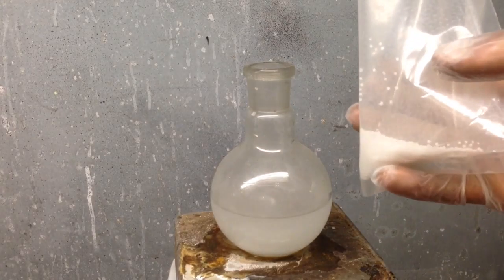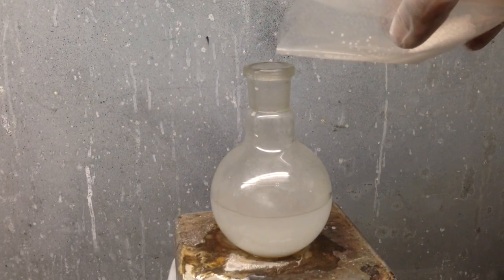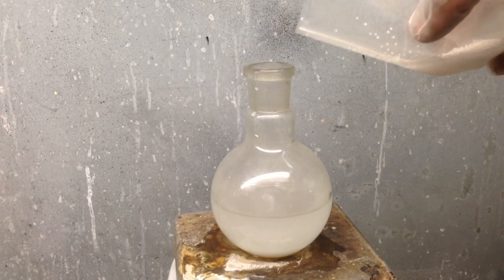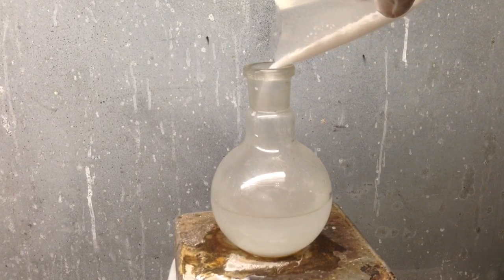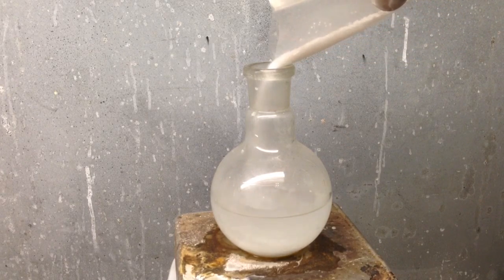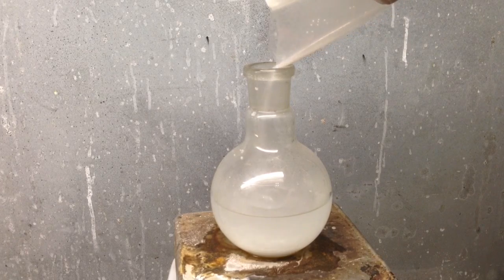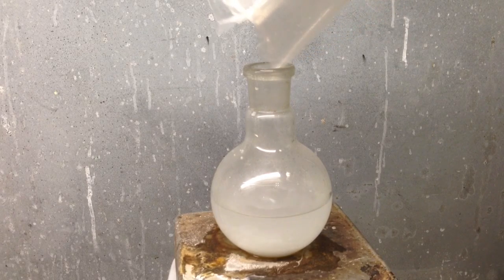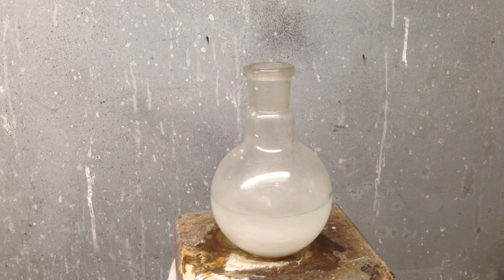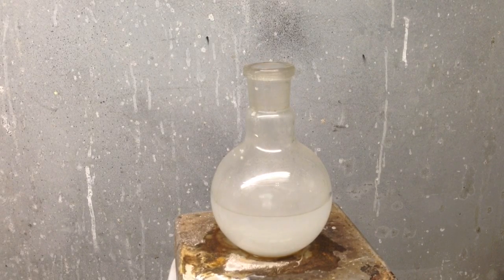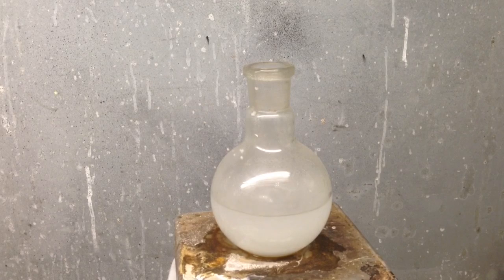So I added about half of the sodium hydroxide at first. It seems pretty well dissolved so far. So I'm going to go ahead and add the other half. We'll go ahead and let the rest of the sodium hydroxide dissolve into the solution before we start adding the silica gel.